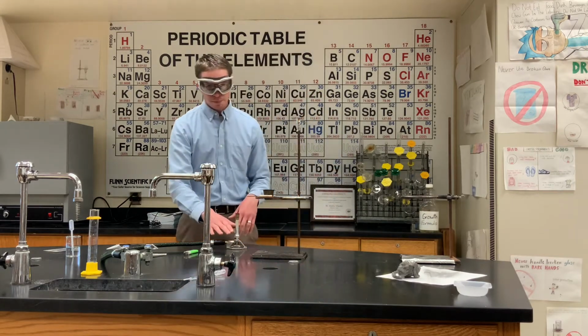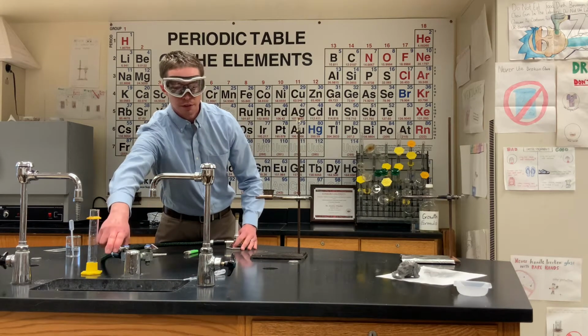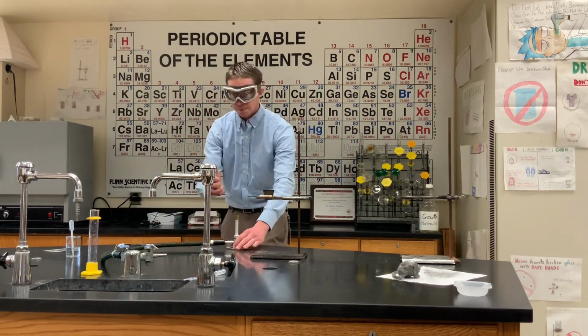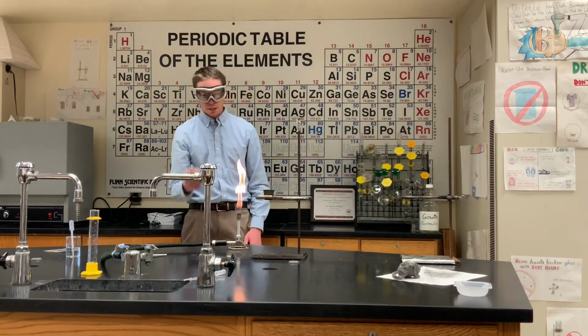I've got my Bunsen burner. I've got the gas turned off down to the Bunsen burner base. It's also turned off here at the gas valve. I'm going to turn the gas valve on. Got my lighter, wrist to the ceiling. I'm going to light my lighter and bring it down next to the Bunsen and slowly open the gas from the bottom. It lights because I can hear the gas. There we go. This is a terrible flame.